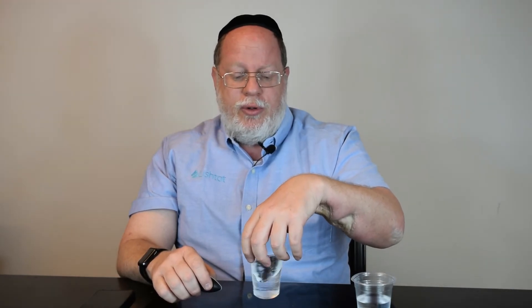On the other hand, we have here a sample that has protein in it. Again, we do our standard swirling, which is very important. Coming in above the water line, and here you see a red outcome. That's because there's less charge transfer between the water and the cup, and so there's much smaller fields.